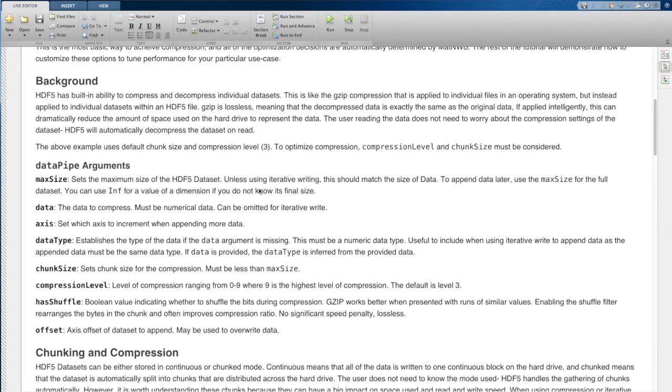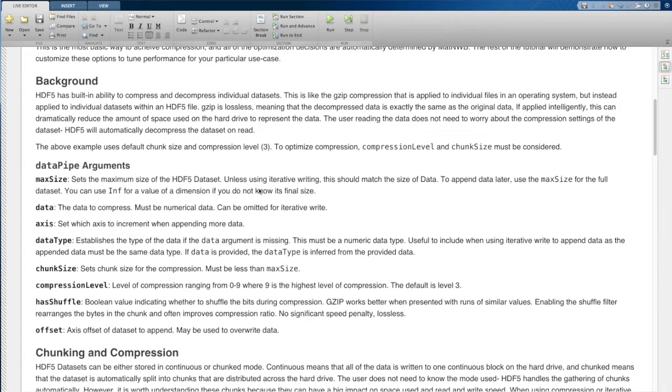then HDF5 will automatically go in and decompress the chunks that it needs to in order to read that data and just serve that data directly to the user as if this data were uncompressed. So that's a really nice thing here. We can specialize how we want to write this data in intricate ways. But then when it's read, the user doesn't have to worry about any of that.